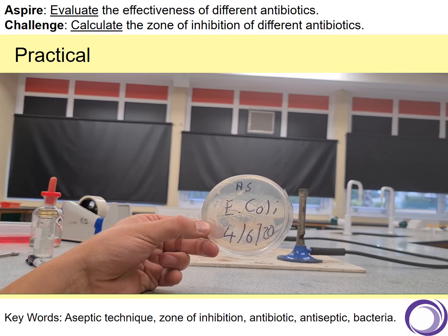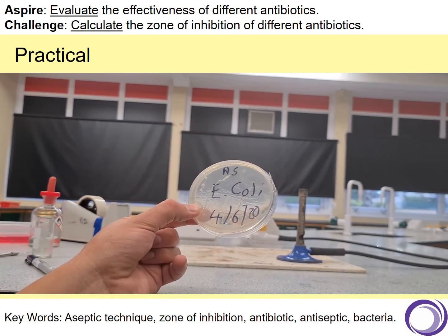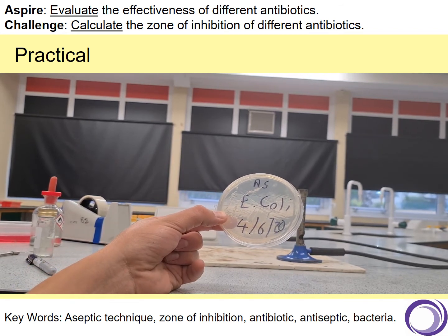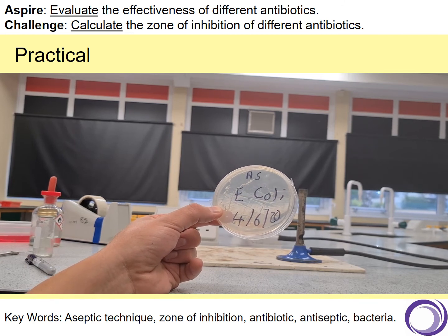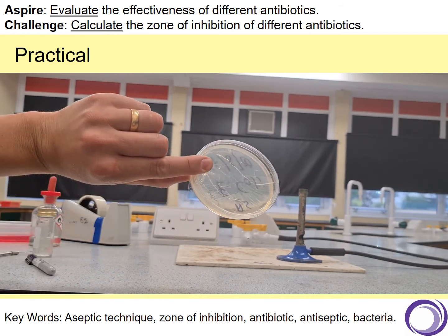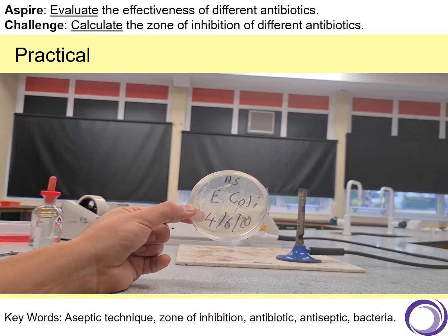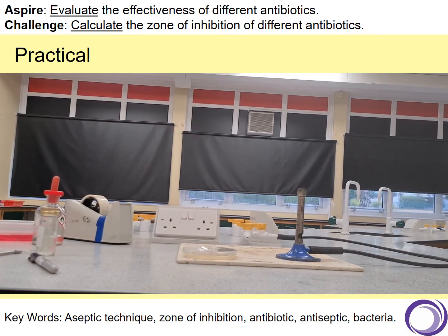25 degrees Celsius. Now, in industry, when bacteria grow best, you're talking 40 degrees Celsius, but we don't want to grow anything too dangerous. So in schools, we only grow them at 25 degrees Celsius. It stops harmful bacteria growing. And that is how you grow your E. coli on an agar plate without growing anything else.